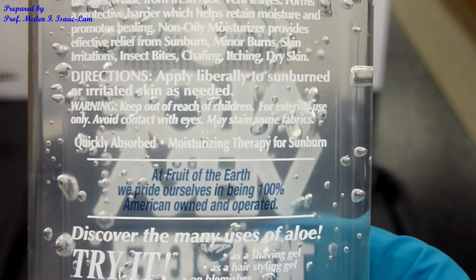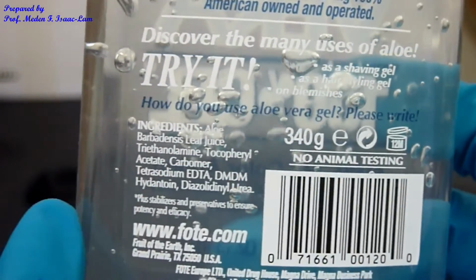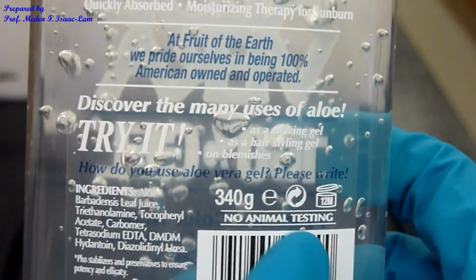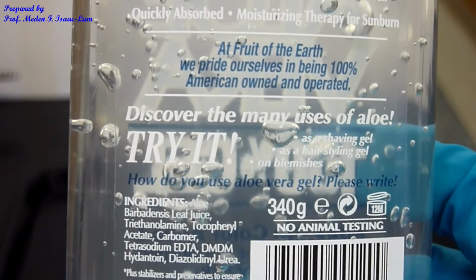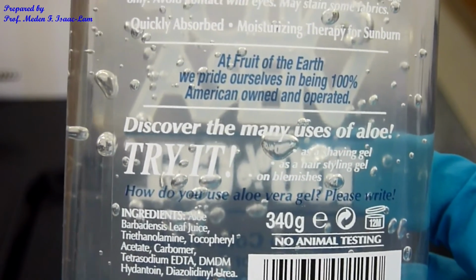Although they claim that they did not do any animal testing. So you can see the fine print in here. As I mentioned, you have tocopherol acetate and triethanolamine. Some of these function as a preservative.